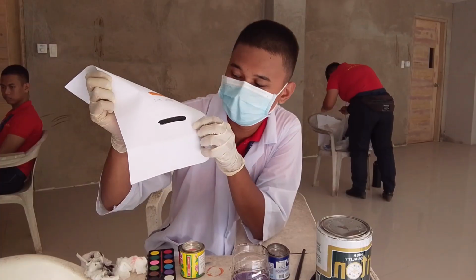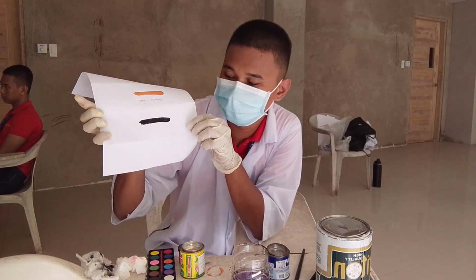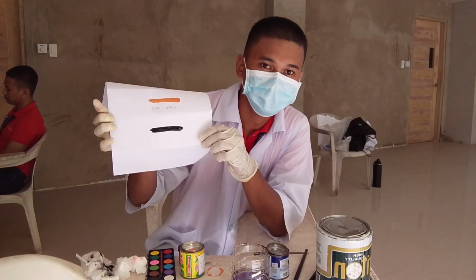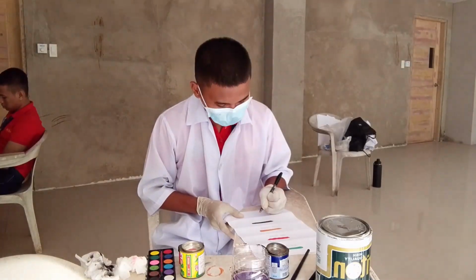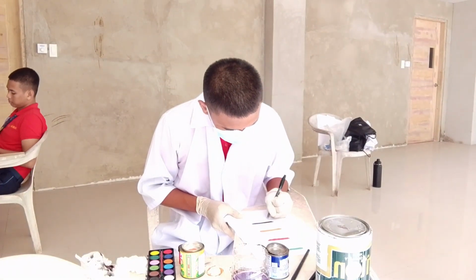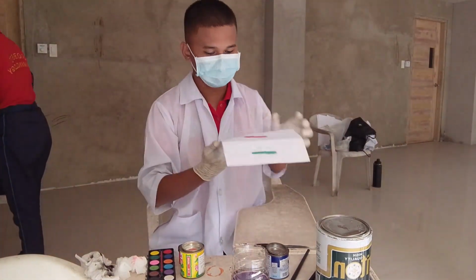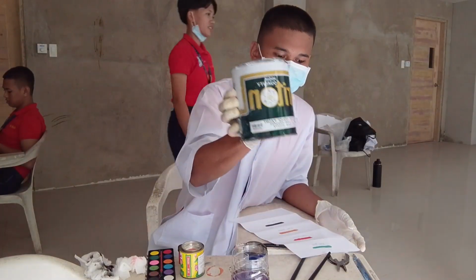For the color, I chose black. For the shade, it is a dark shade. For the paint type, it is alkyd and oil based. So I will now put the label. I am done labeling the oil paint. Next is the semi-gloss paint.